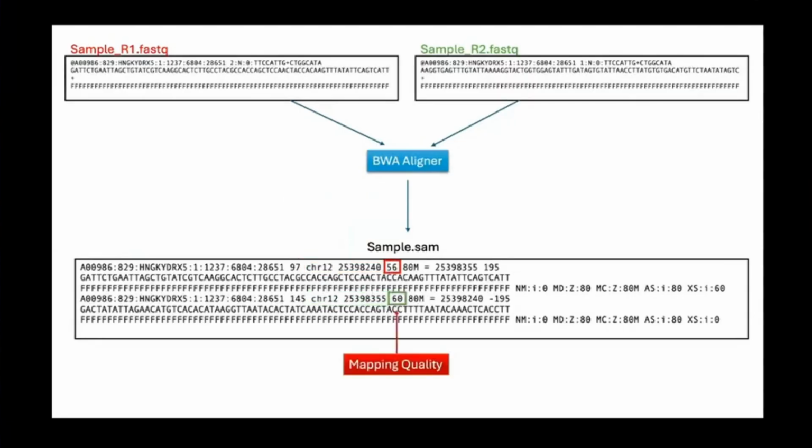Here we have mapping confidence scores. A top score is 60, indicating the aligner is very happy about having only 1 unique place in the genome where this read can go. And a bottom score would be 0, or a total lack of confidence that the read has been assigned to a unique location. If you're dealing with multiple copies of a gene or pseudogenes or repetitive DNA elements, then you'll end up with a lousy score.